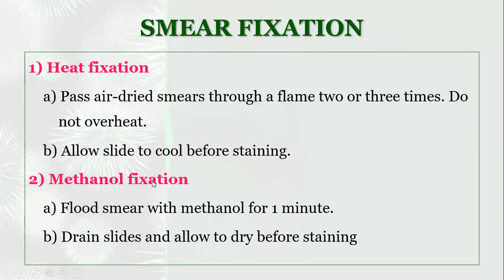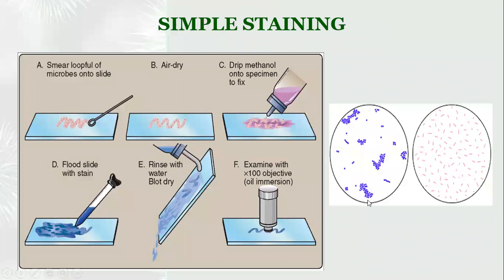Methanol fixation: after air drying, methanol is added to the smear and allowed to stay for 1 minute. Meanwhile the methanol evaporates, and it causes fixing of the organism to the microscopic slide. And these are the methods of staining.